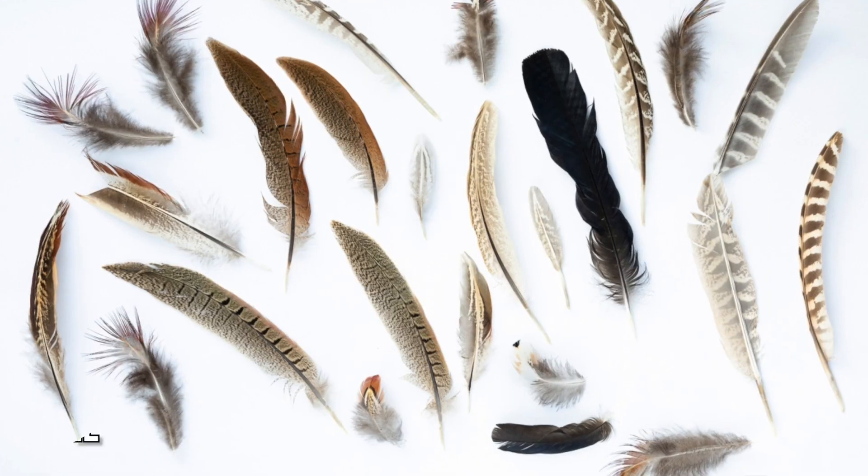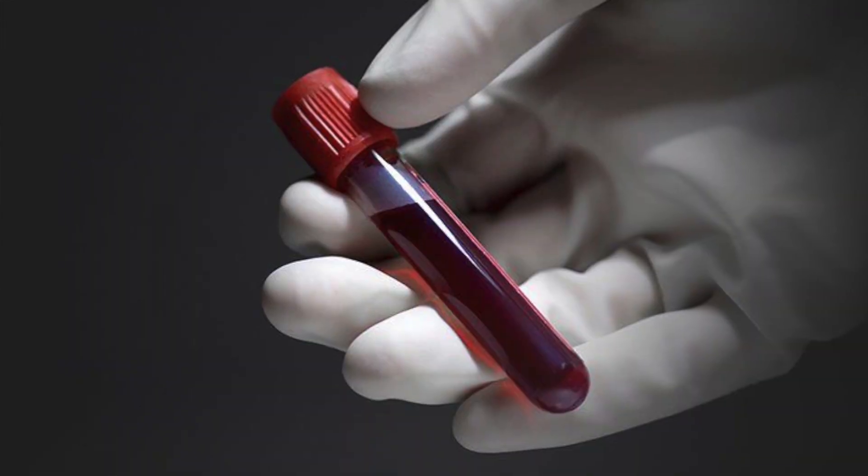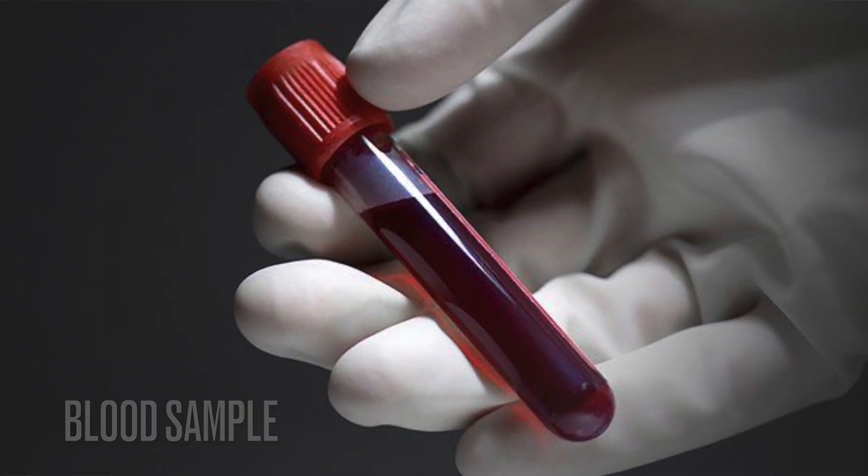Now there are two methods you can use to actually DNA sex these birds. You can use feather samples or you can use blood samples. Today I'm going to show you how to use a feather sample, and my preference is feather. Blood is a little bit more dangerous. It's not as easily extracted as a feather from a bird, so feather is always my preference.